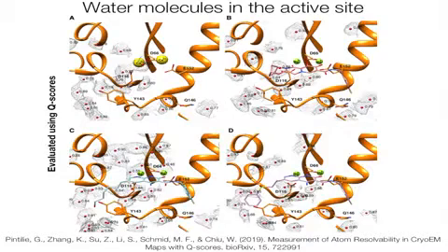Now, I already mentioned water molecules. We see them throughout the active site. This slide shows the density and the location for some of the bound water molecules in the active site of the apoform. The apoform contains calcium, as well as 3 of the INSTI bound forms. These INSTI bound forms contain magnesium in the active site.